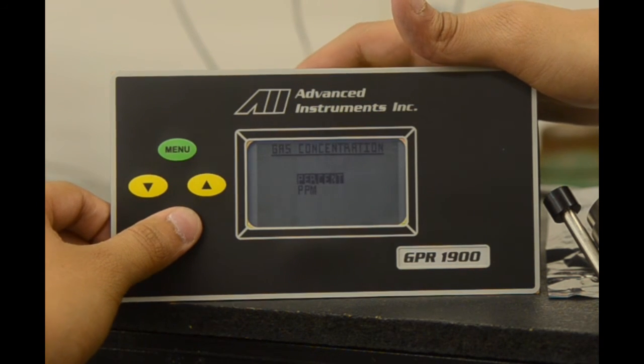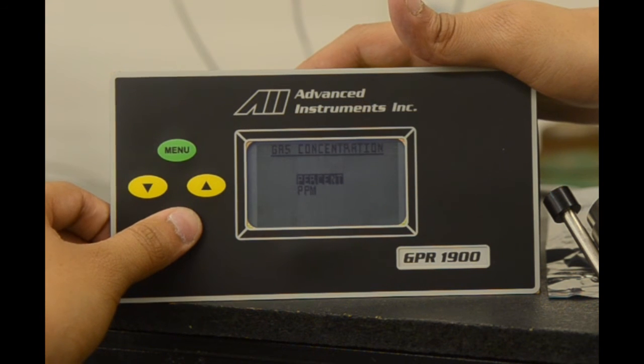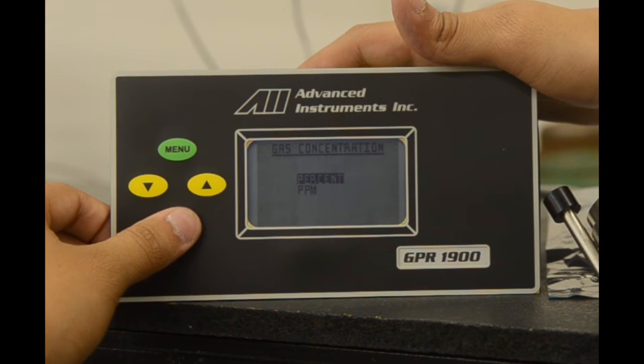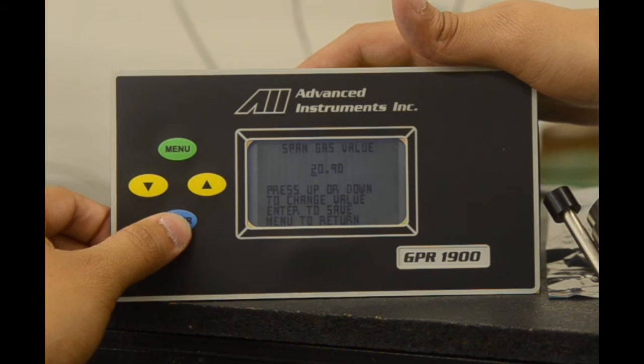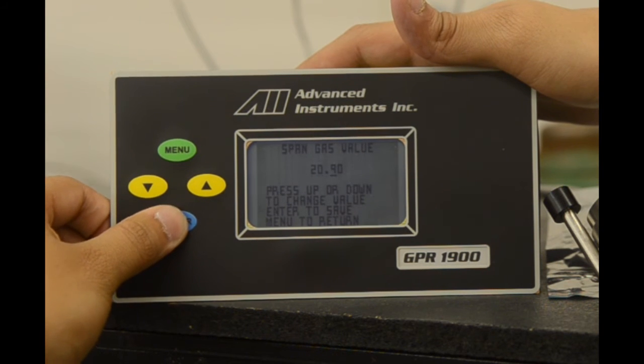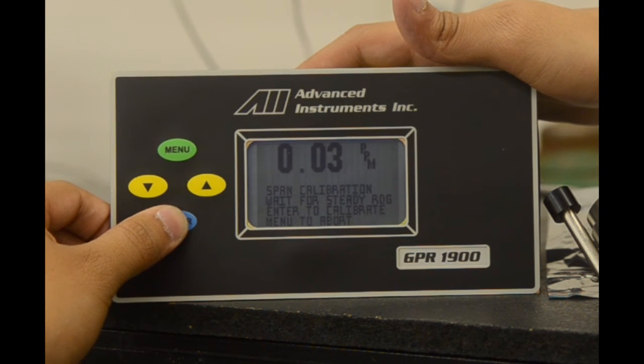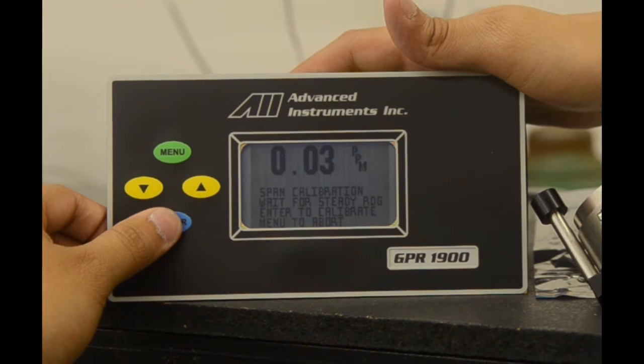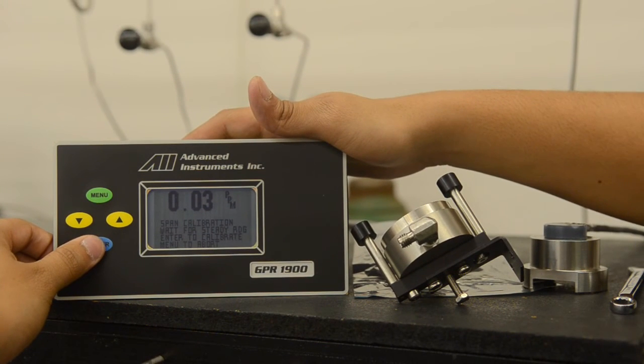Once these are performed, we can scroll back up to span calibrate and select enter. We will be performing an air calibration, so we select the percent. We can easily do a ppm calibration as well. We select enter on percent and it is preset at 20.9, which is the amount of oxygen present in air. We select enter to scroll through and are taken to the screen that shows the current reading of the analyzer.